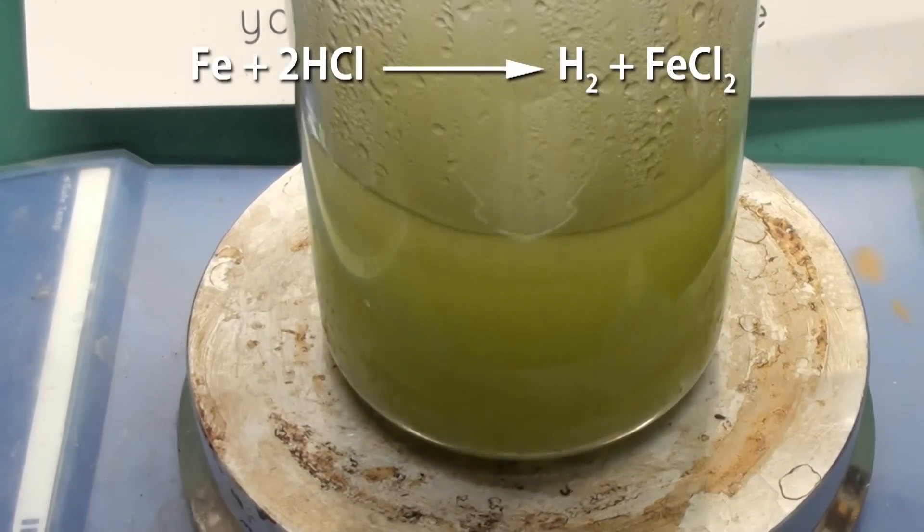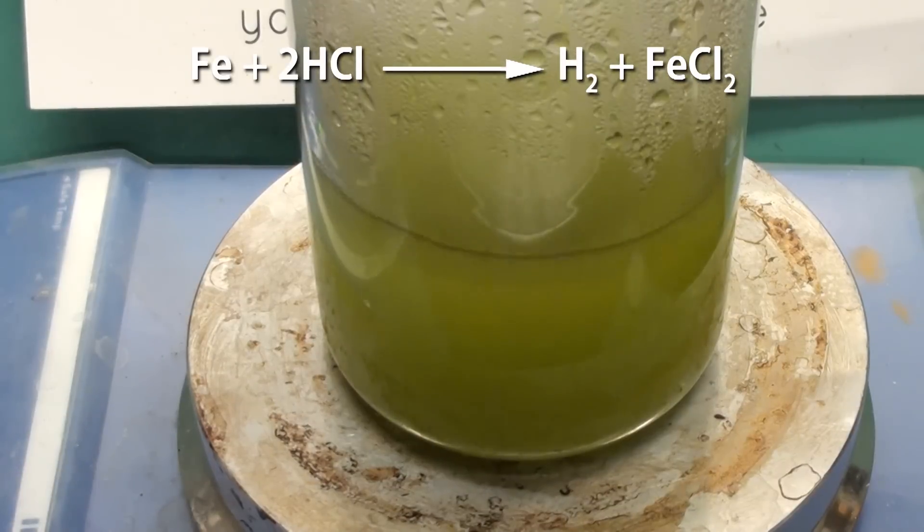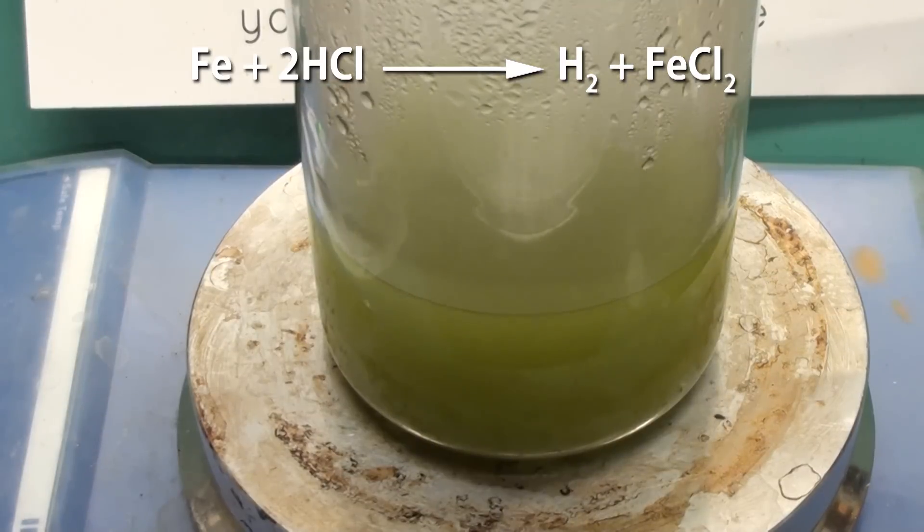What's happening at this point is the iron is reacting with the acid to produce hydrogen gas and green iron chloride, also known as ferrous chloride.